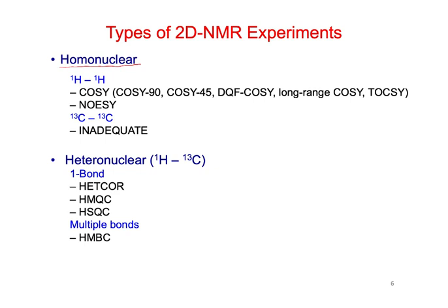Okay, so these can either be between two protons, or we could do it between two carbons. Okay, so we have a list of types of experiments for each of these, and in some of these we're going to take a little bit of a historical look at what types of experiments were first developed, and then look at the ones that are being used more currently.